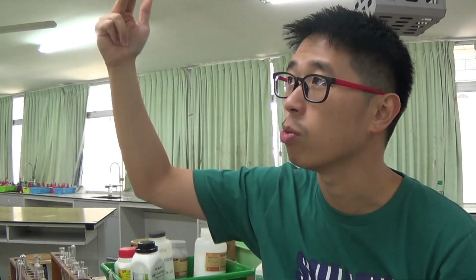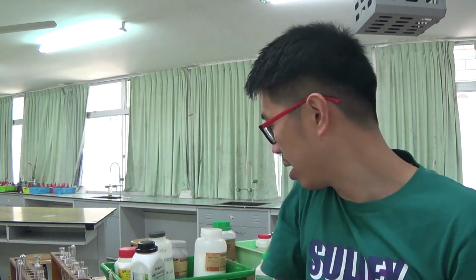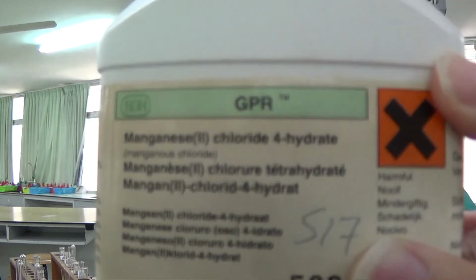So we're just looking at when the purple color disappears or when the first permanent hint of purple remains, depending on whether you have the purple color solution coming down from the burette or if you have the purple color solution pipetted out into the conical flask. So what I'll do is I want to test for manganese 2 plus.